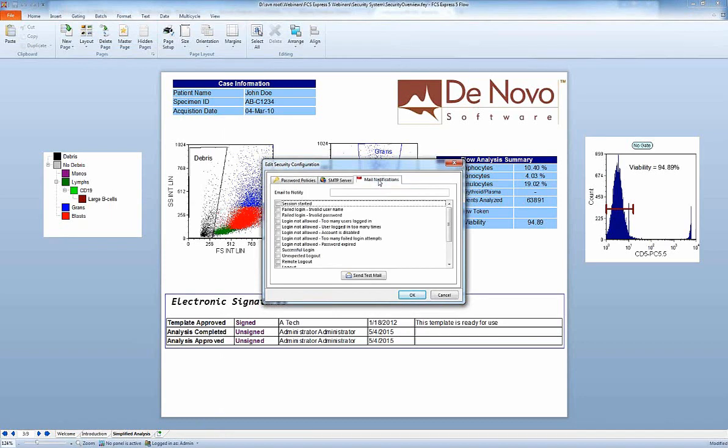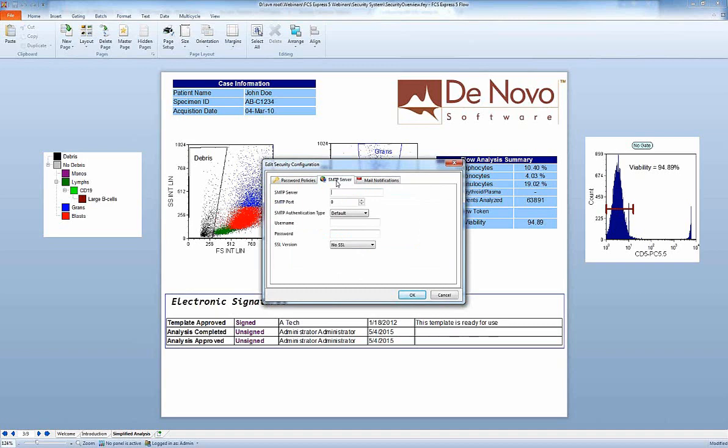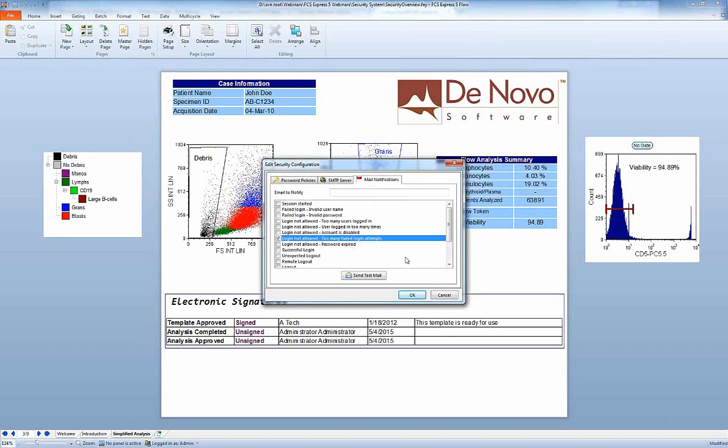As an administrator to the system, you can also set yourself up to be notified by certain events. So for example, if somebody is not allowed to log in because they've failed too many times, instead of waiting for that person to complain, you can let yourself be notified. You just put the email to notify here and click on which notifications you're interested in. This uses email to notify, so you'll need to set up an SMTP server. This is just an outgoing mail server. You can use an internal one or an external one. You can use one that has encryption and security on it. You can use one that doesn't even require logins. Fill in all the details here and whatever ports and whatever authentication type you need, and then it'll send you notifications when whichever of these events that you're interested in happens.